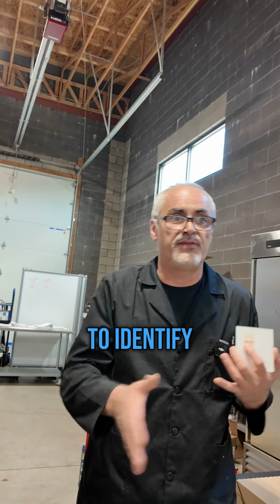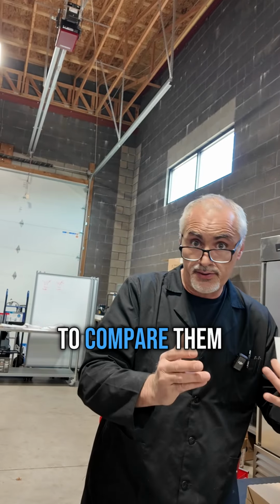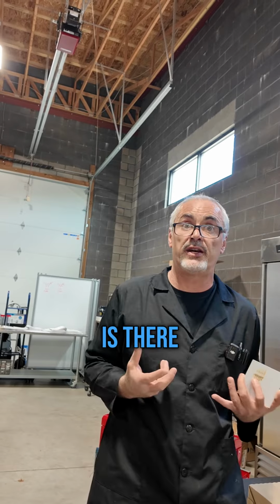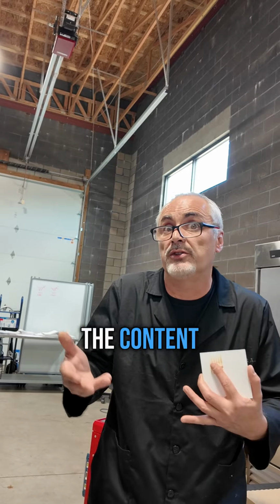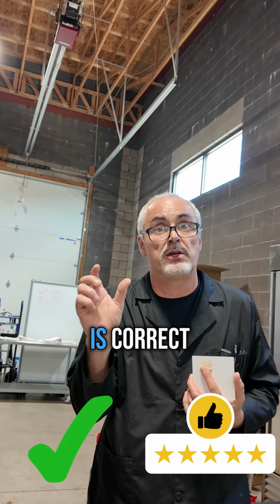When we're able to identify the zinc, these are signature wavelengths for zinc, and then we're able to compare them against certified standards and quantify the amount of zinc that is there. So not only are we doing a qualitative check to say, is it zinc? We're also checking the quantity of zinc that is present in that material. We'll often get things like zinc lozenges, and we'd have to test the content of the zinc in that lozenge to make sure that the label claim is correct and accurate.